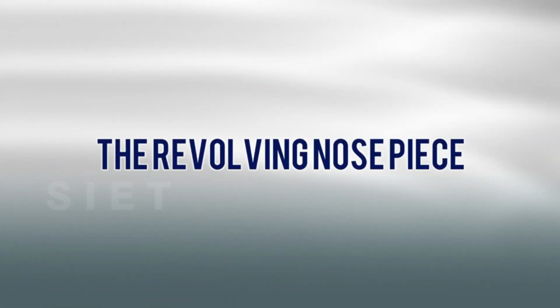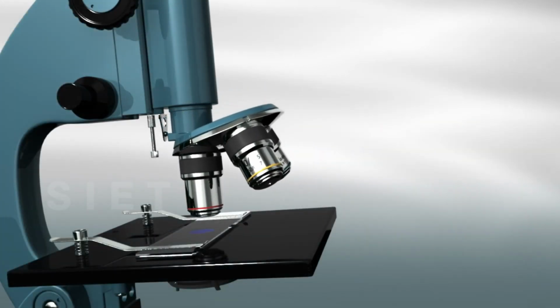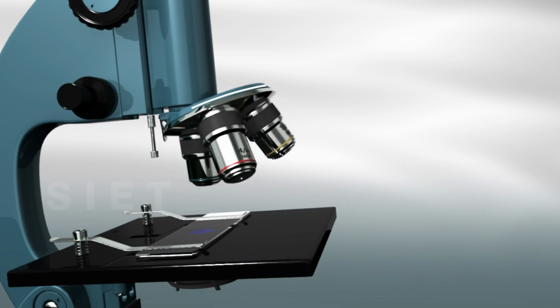The revolving nose piece. It holds the objectives and allows you to change them while looking at a slide or sample.